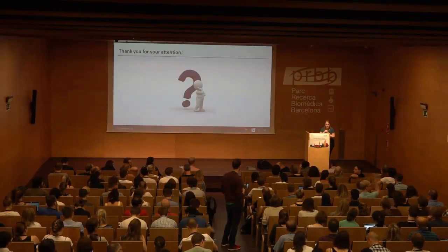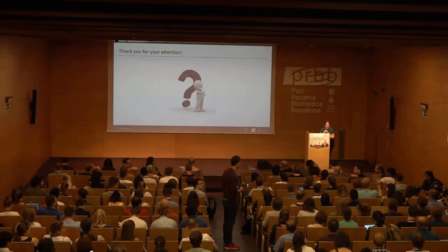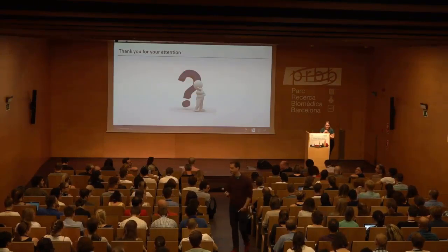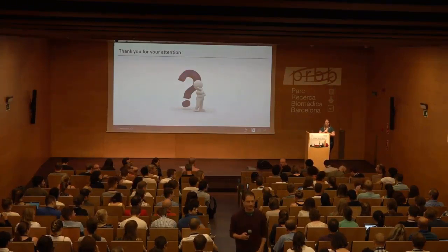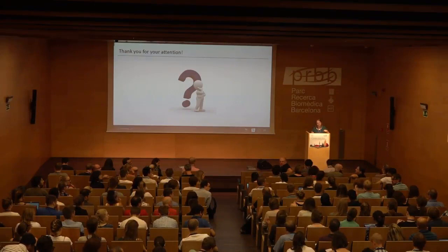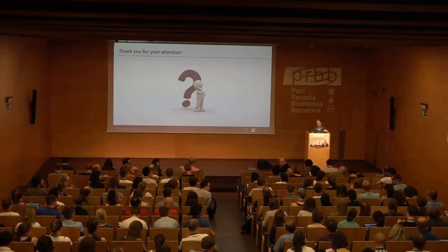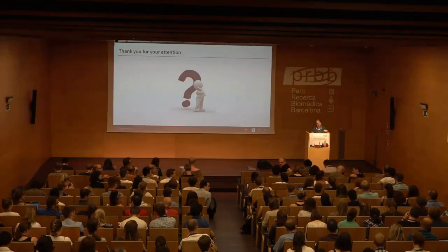Thanks for the great introduction. I might jump on that modification train. I always ask myself, is it possible before running the long main search to give us an output telling us about the search space versus the amount of fragment scans, to basically judge whether the search makes sense?